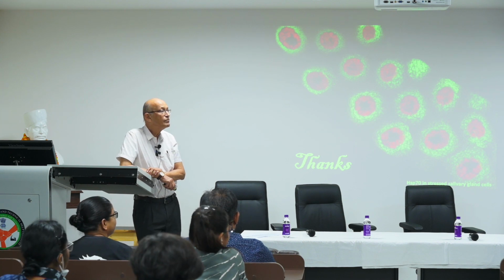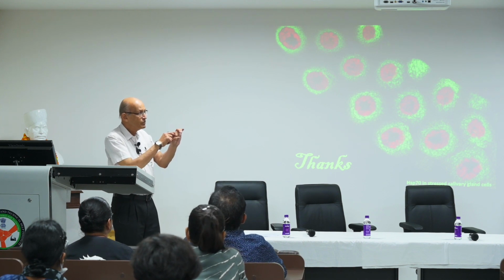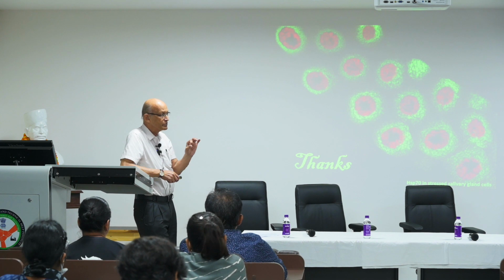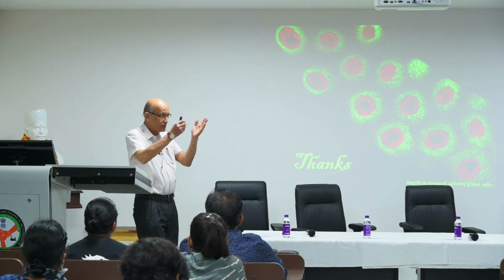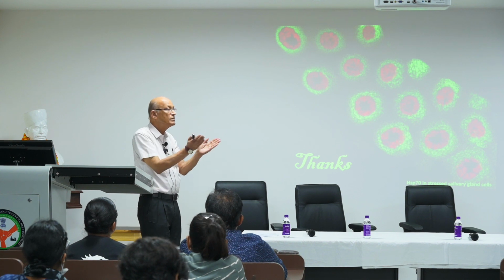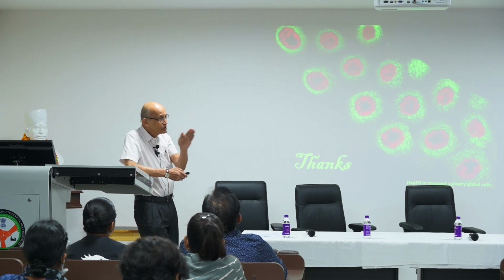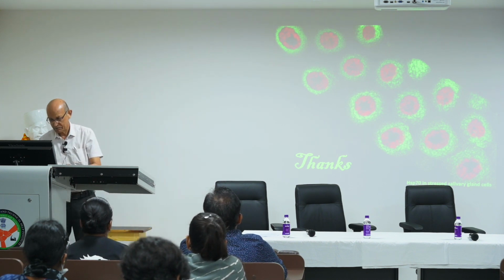So what is the correlation between pinhole and Airy unit? See, the size of the pinhole: for example, if your 1.4 NA numerical aperture objective lens gives you a limit of resolution of 200 nanometer, and your pinhole is 400 nanometer, then you are not collecting the image only from the point of focus. You are collecting the peripheral out of focus rays as well. And so the total light intensity that you receive becomes more, your image looks brighter, but you are losing the limit of resolution. See if I can, let me go back.